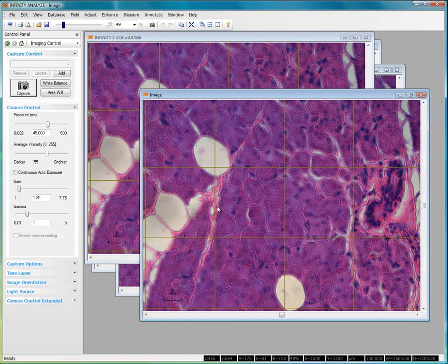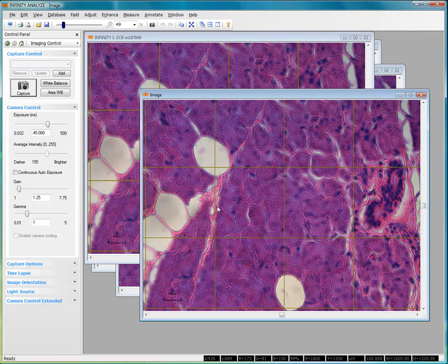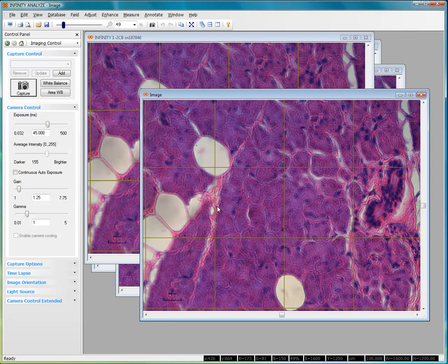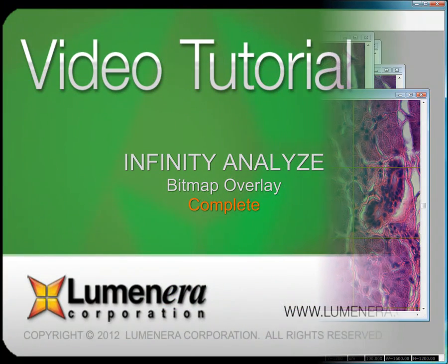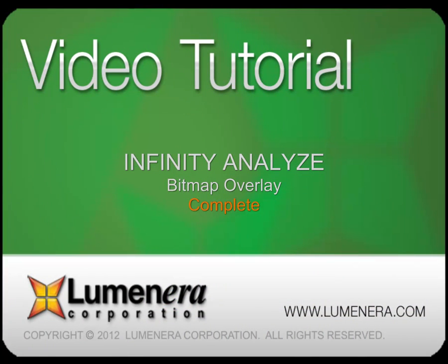So whether you decide to use a small bitmap overlay, or an overlay that matches the full resolution of your sensor, combine the tools available within Infinity Analyze, along with your own imagination, to create the results you require. Be sure to take a look at the other videos in this series.